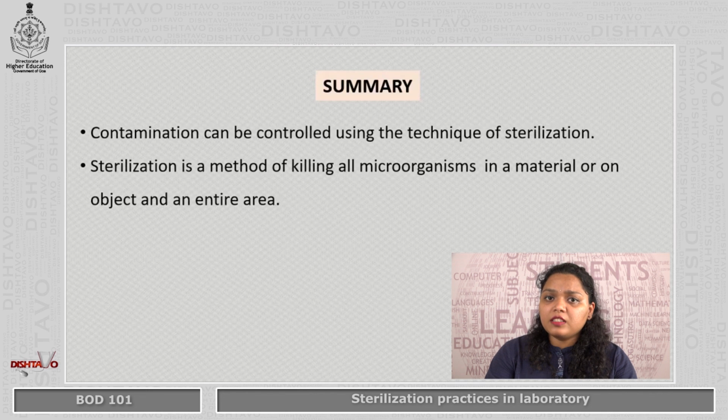To summarize this module, contamination can be controlled using the technique of sterilization. Sterilization is a method of killing of microorganisms in a material or an object or an entire area.